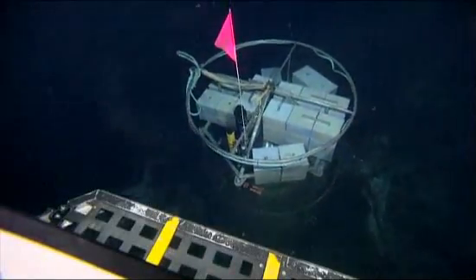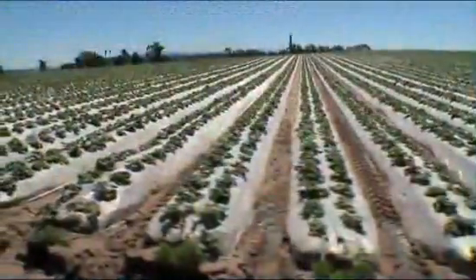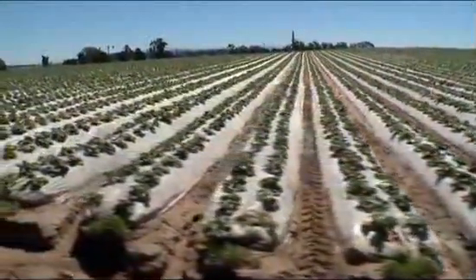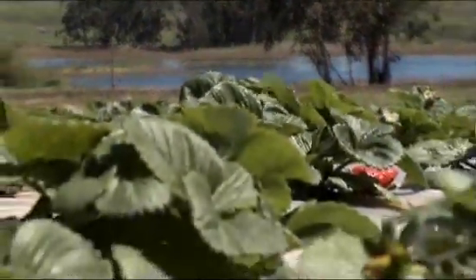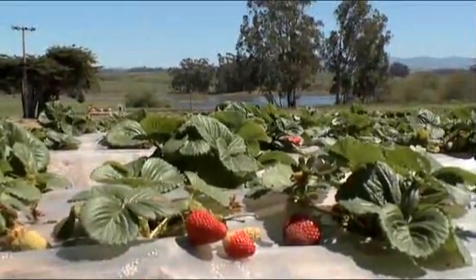Researchers say an ESP network might one day crisscross our oceans, monitoring for problems like oil spills, or on farms to detect microorganisms like salmonella in the water used to hose down crops before they're shipped to market. Wouldn't it be great if we could detect out in the field before it gets into the packaging plant and onto people's tables? I think it's real exciting stuff.